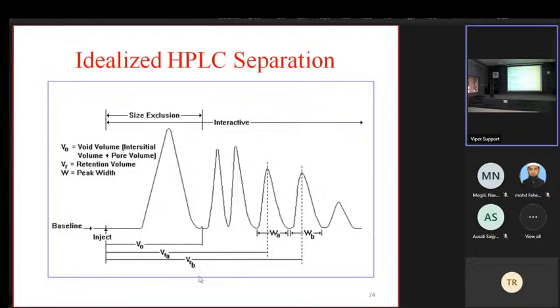Anything related to detectors, or anything related to solvent systems.